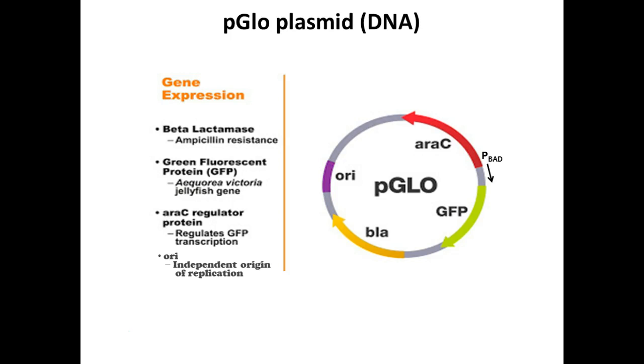We saw this before on our Kirby-Bauer plates. Ampicillin kills E. coli, right? It's one of those modified penicillins that actually works on gram-negatives like E. coli. So we're going to give it this resistance. And this is going to encourage them to keep the plasmid because we're going to grow them on plates containing ampicillin. So if they don't keep it, they will die.